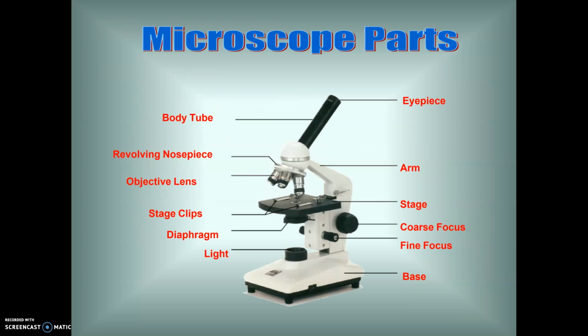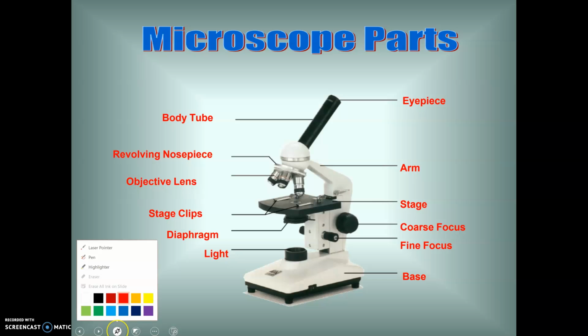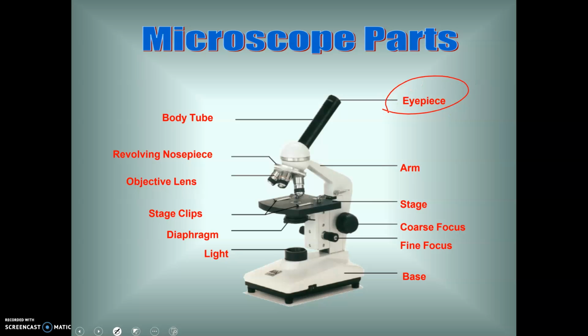These do plug in. All right, as far as the parts, you're not going to need to know every single microscope part, but I want to focus in on just a few of the really important ones that you definitely want to know. So the eyepiece, this is what we're looking through, and this magnifies 10 times.